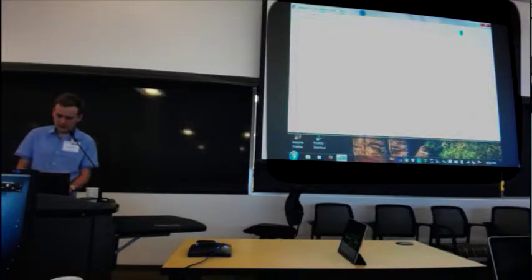For me it will be Nass. Now you should make a new directory which is named CASS tutorial. Then you should go to this directory, CASS tutorial.